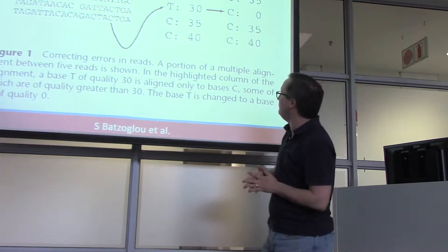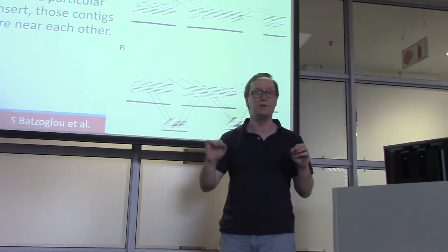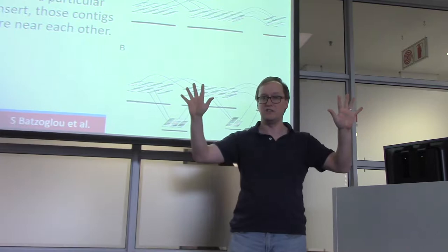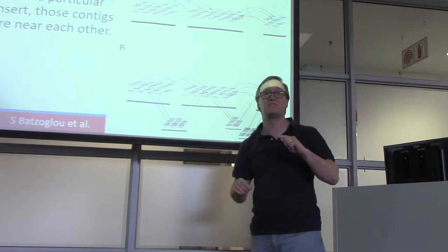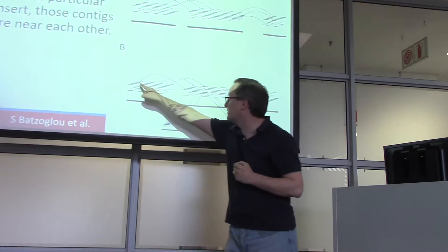Okay, great. So now let us return to our fine question of paired end sequencing. We showed you the molecular biology version of it with the 3' and 5' primers, etc. We've also shown them as light blue bars that had these dark blue patches on the ends, the dark blue patches representing the part we actually sequence. You're going to see yet a third representation of paired end sequences here. So in this case, these arcs represent a contiguous piece of DNA, and the patch, or the horizontal line on either end of it, that now represents the part that got sequenced.